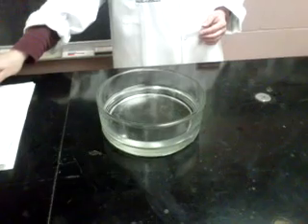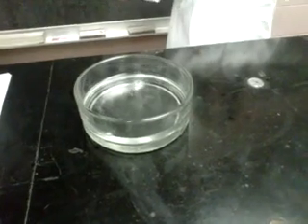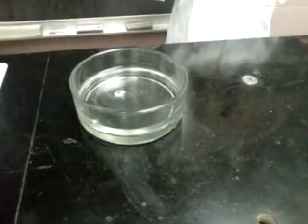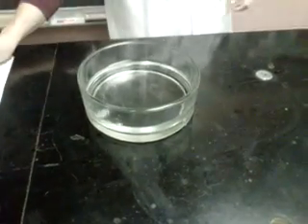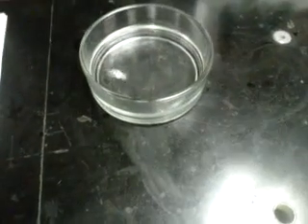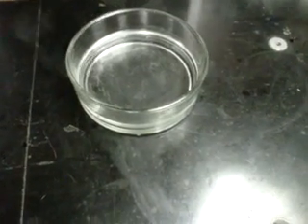Should we put the bigger chunk in now? Yes, put a whole piece of it. Okay, remember this is lithium, at the top of the alkali metals. Are we surprised to find a reaction between metal and water? Yeah, you should be. It's hot and it's cooling down. So this is a chemical reaction. It's dissolving in the water. It wants to get rid of that electron.